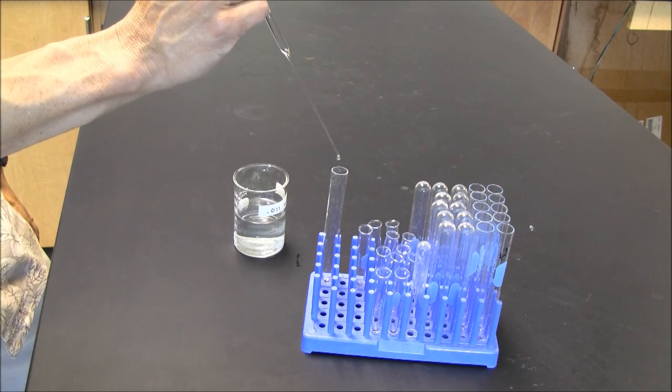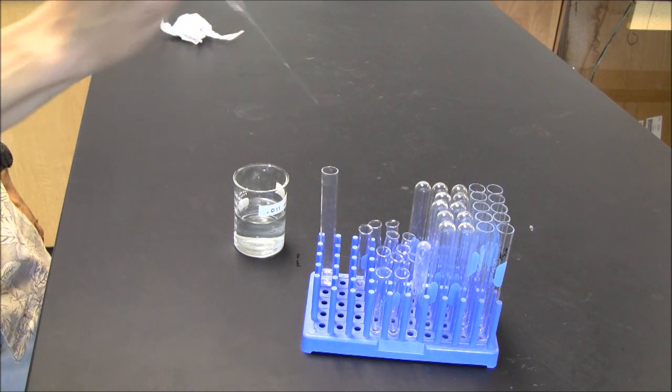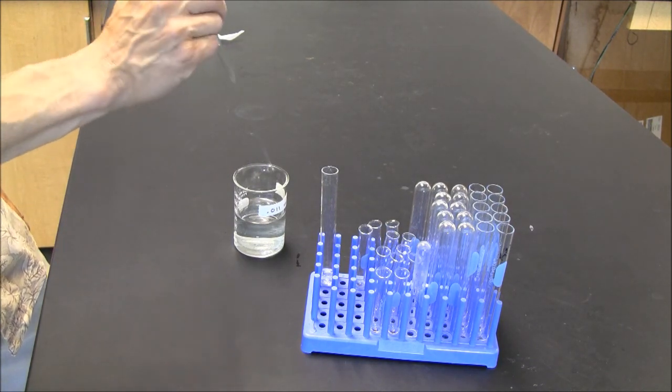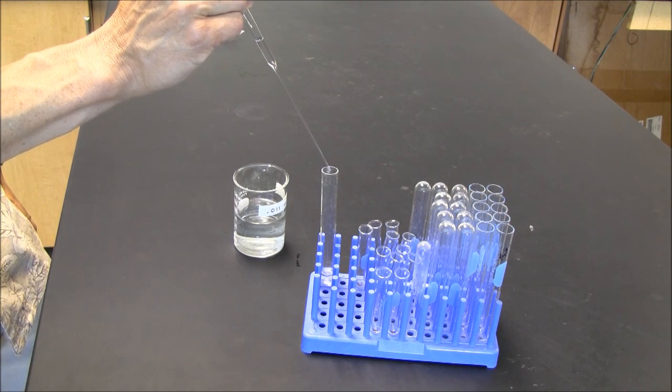I can add my liquid drop by drop if I wish, or faster if I wish. I can go back. Notice I'm getting two fingers on the glass. I can go back and pick up more. Nice, steady, well-controlled transfer of liquids.